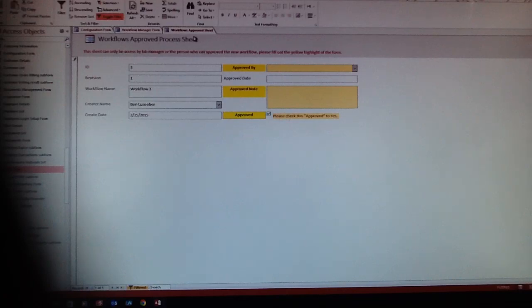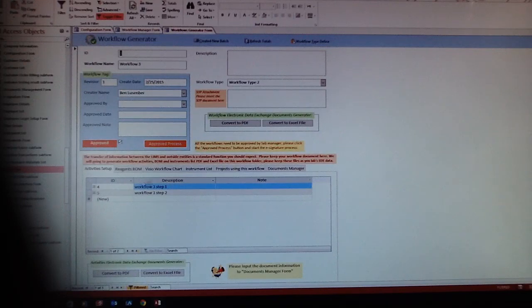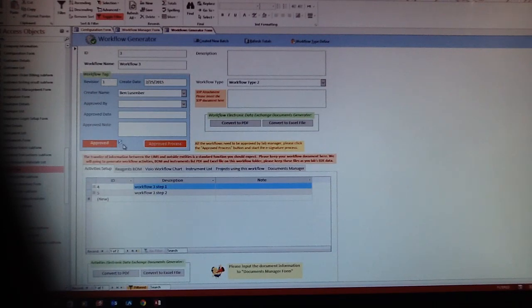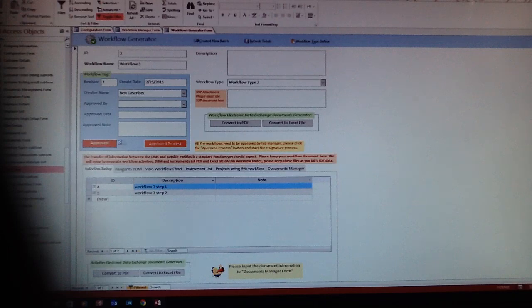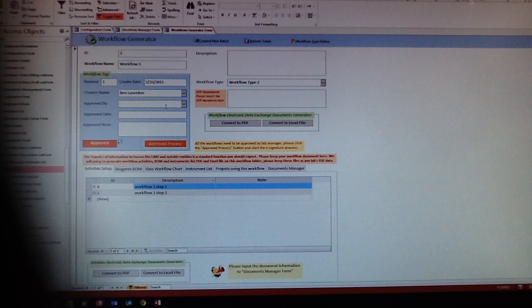It's approved, so you can use it. But we lock up this page so people who don't have accessible levels cannot approve this workflow.